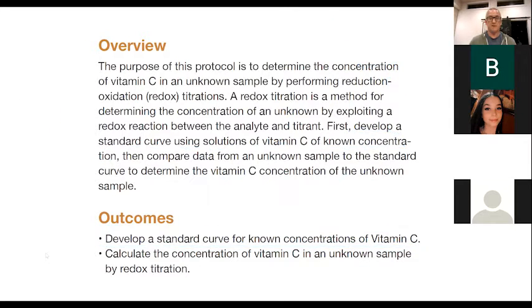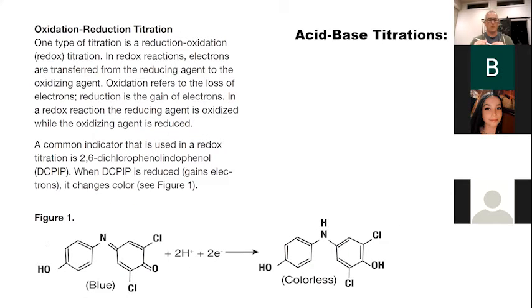All right, so this is what we're going to be using to do the titration tonight. So this is called DCPIP, or 2,6-dichlorophenol-indophenol, which is really easy to say. Basically, it has two phenol groups. You can see there's one here, and there's one there. And when it's reduced, when it gains electrons, you can see that this reaction is oxidized over here, and it's reduced over here.